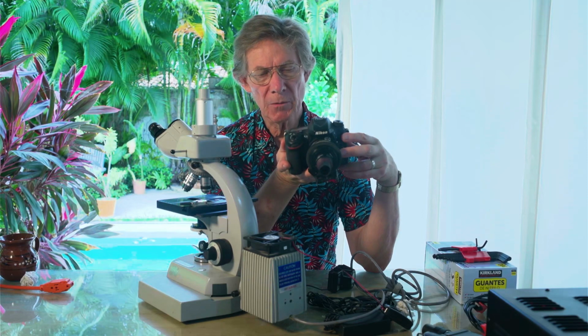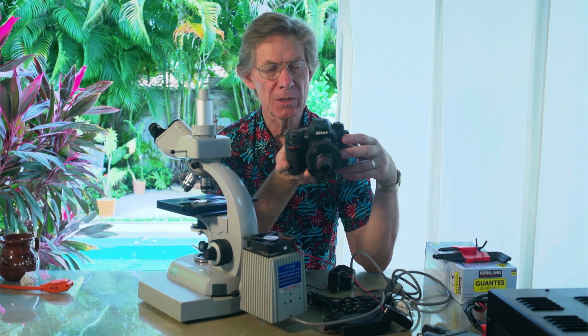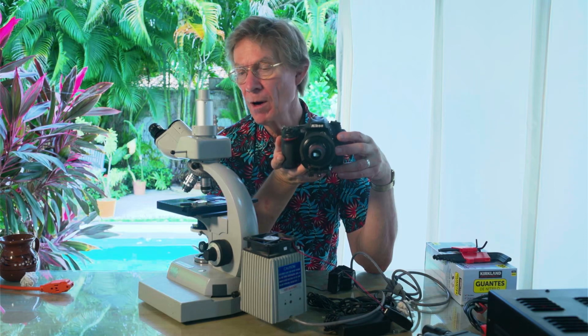So this older Nikon camera that I've been using for many years very soon is going to be replaced with a very sophisticated DSLR camera. We will be experimenting with this and other cameras with digital technology to find the very best cameras for microscope work that we can possibly use.